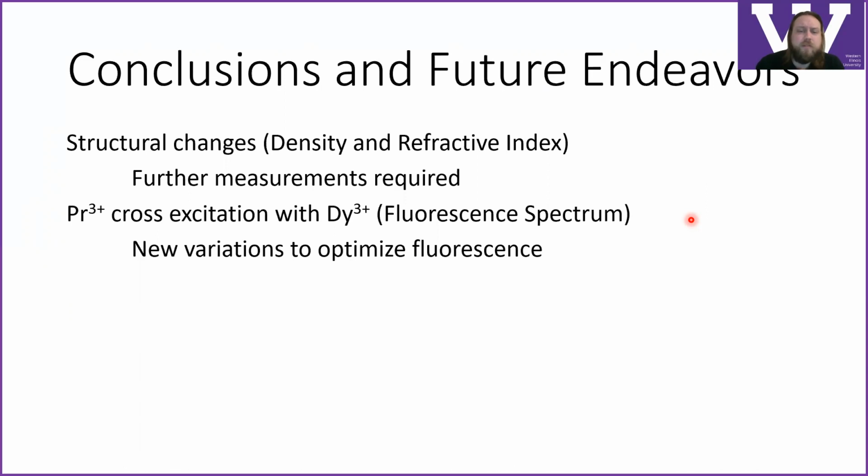And then if we want to increase our fluorescence after we learn a little bit more about it, we can maybe try some new variations of dysprosium content or other types of content in order to get more out of this.